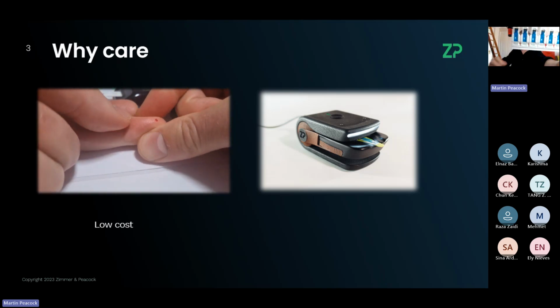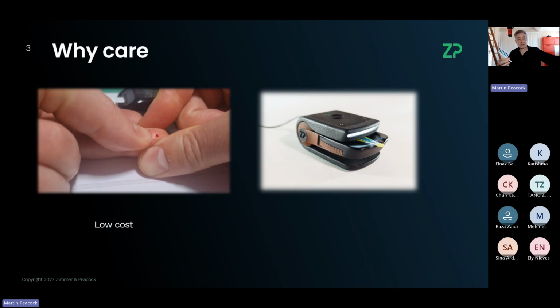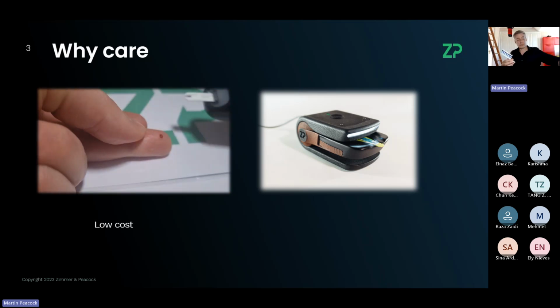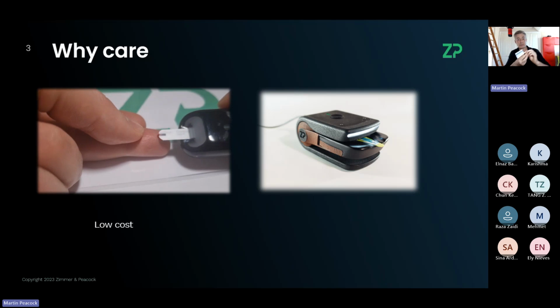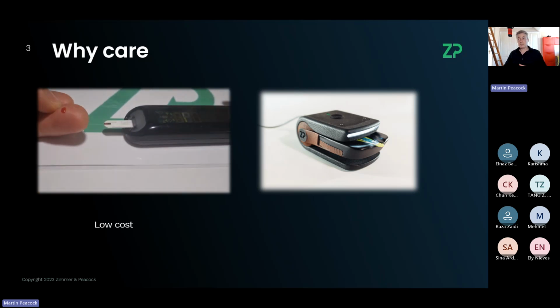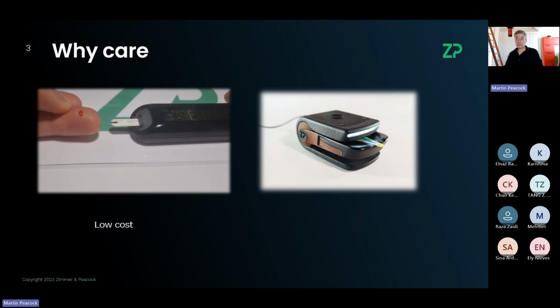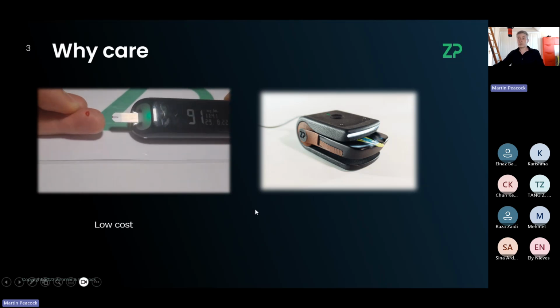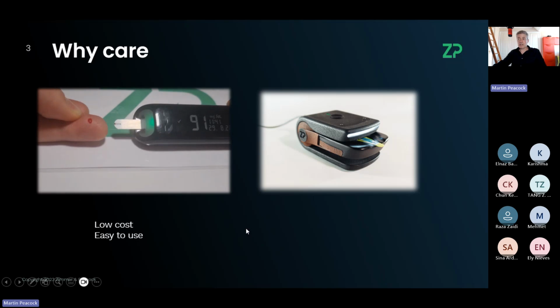This kind of technology can be low cost. The reason I say "can be" is because they get such low cost when making glucose strips by producing billions per year. The higher your volume, the lower your cost per item, and actually the better quality per item as well. So high volume manufacturing does drive down costs.